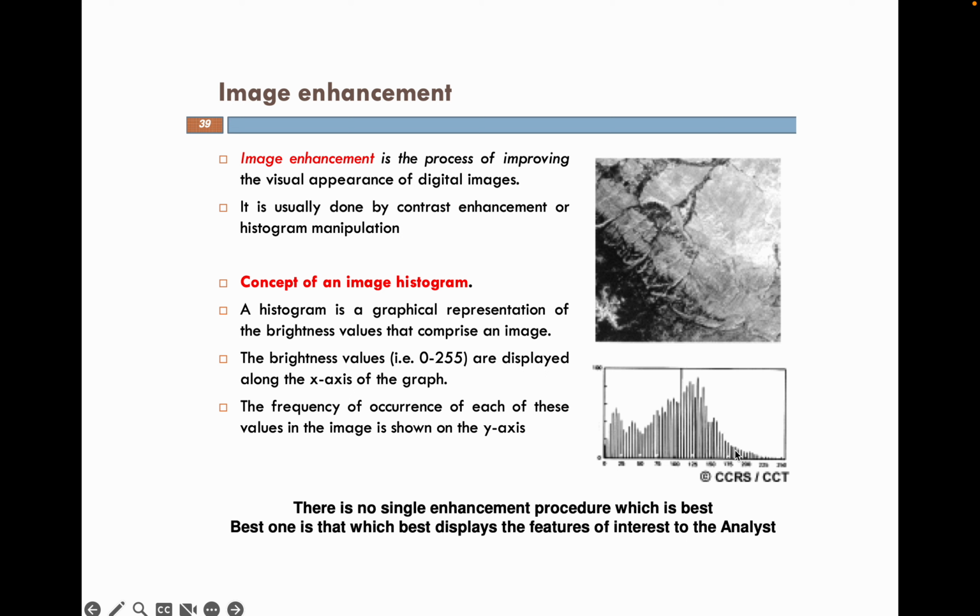You can mathematically spread out the rest of the data. And so the darkest pixel is 0. And when you're adjusting contrast, that's essentially what you're doing. You're spreading this function out or condensing it down or shifting it a little bit to the right or to the left if you want to make it brighter or darker, respectively.